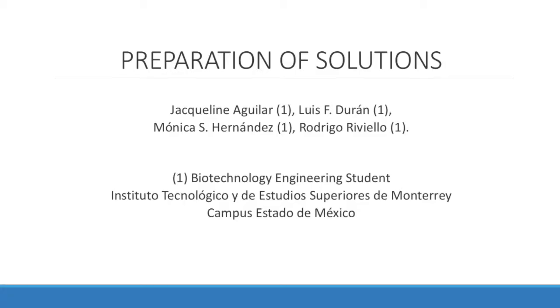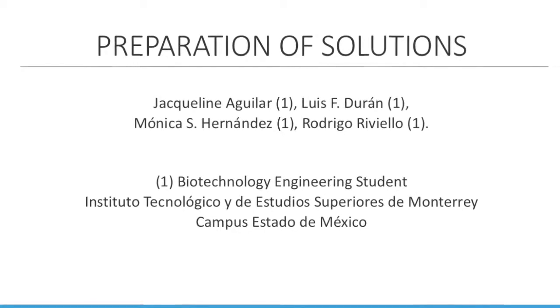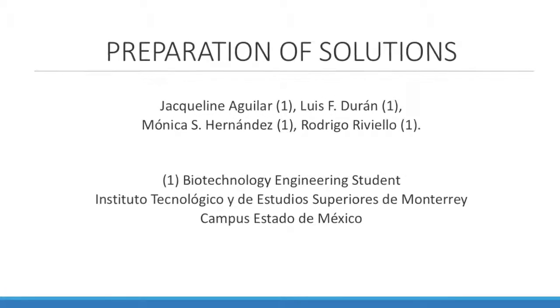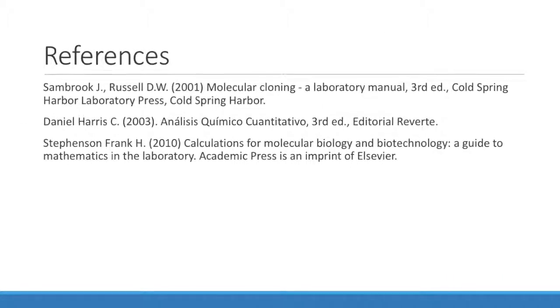And finally, our team's conclusion is the following. A proper preparation of solution will be feasible if both theoretical and practical phases are performed correctly. It is also important to know the nature of the solutions that are being prepared so the right precautions are taken, not only for the preparation but for the disposal too. These precautions should be reported in the literature and will increase the quality of the solution.